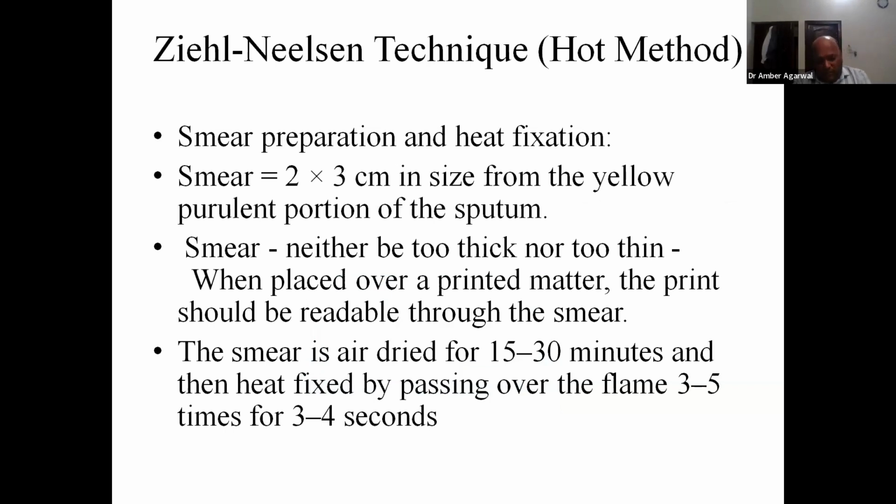Now, when we perform a ZN stain, first of all is the smear preparation. For any smear preparation, I would say that it should be neither too thick nor too thin. When we see through it, the print material of a newspaper should be readable. And it is air dried and heat fixed.